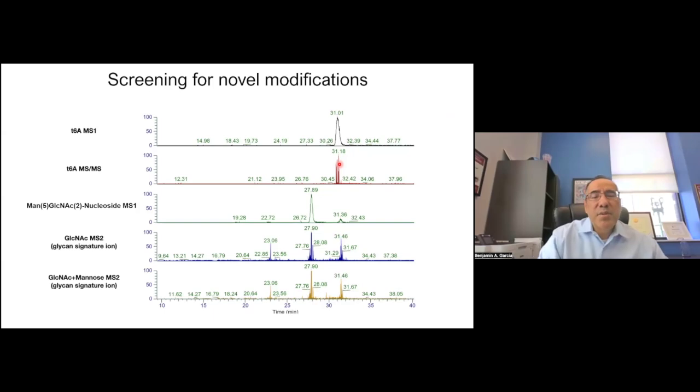And so we've been doing this, and this got us down a path, which I'll talk about a little bit more later. But when you line up the peaks and start looking at what MS-MS fragments line up within a base peak, you can see that there are several species coming out here, and it allows you to identify certain modifications.